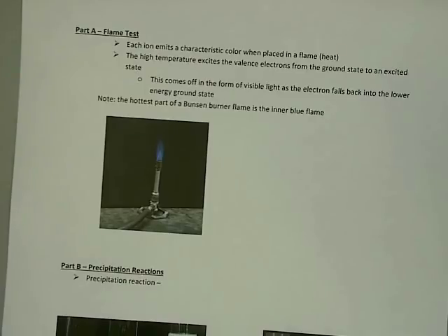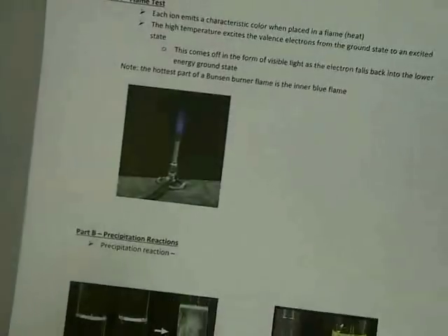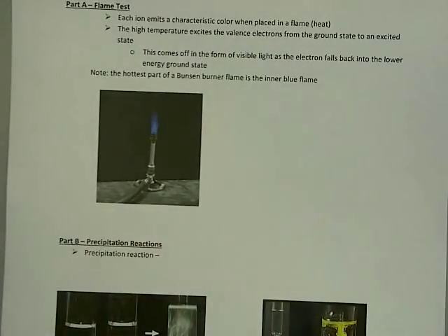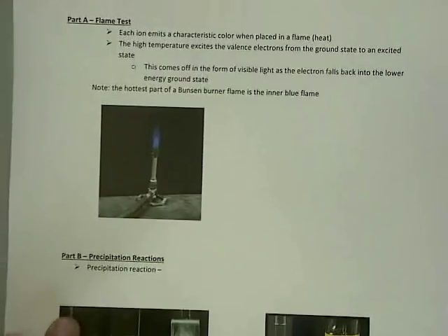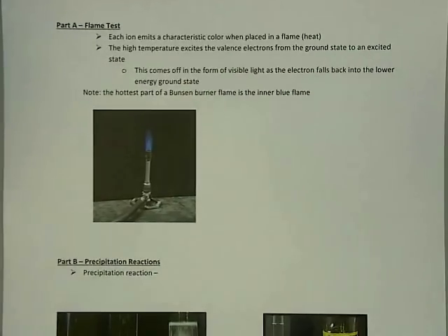You're going to perform the flame test. Here we're talking about part A. You're going to perform the flame test on your 5 known compounds. You could also group your unknown with each of these parts so that you don't have to go back and repeat all of your experiments again. Each one of you gets an unknown. You're working in pairs this lab, but each one should have their own specific unknown. And of course, make sure you write your unknown number in your lab notebook.